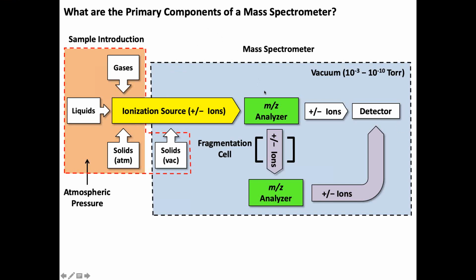MS is generally just measuring the intact molecular weight of something, the intact form of a given molecule. Whereas MSMS usually means you're measuring the fragment of a parent or intact molecule. MS to the N can be 2 stages, 3 stages, and so forth. Practically, you're really limited to MS to the 3rd or 4th, maybe. And then, of course, you're left with detecting either the intact form here at the detector or the fragments of the intact form.